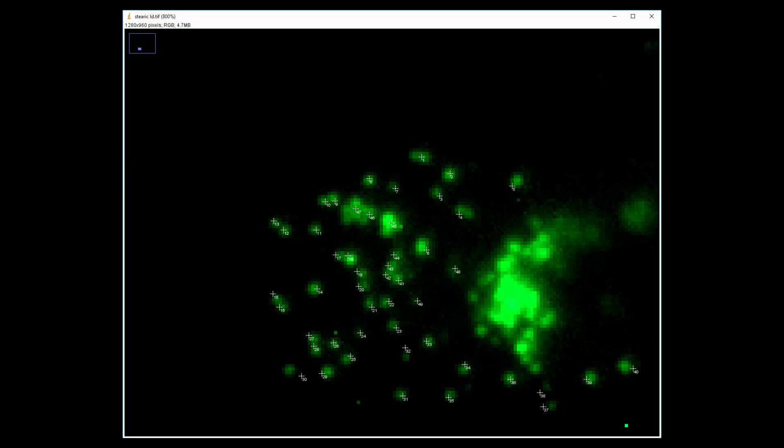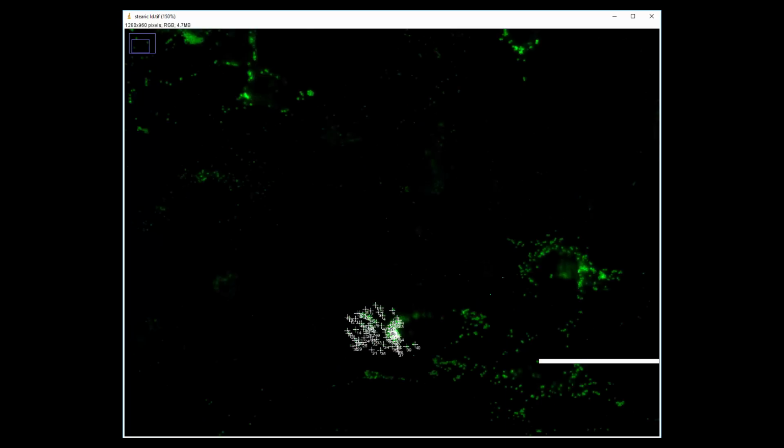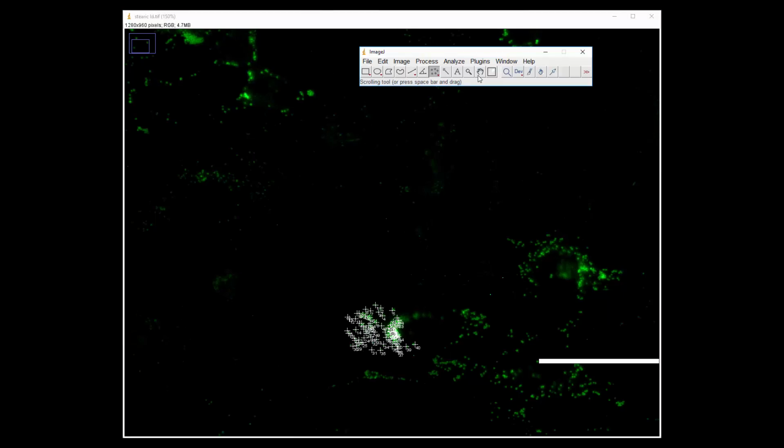But if you have to do something like this, here's what you have to do. I always go with the bright spots as my lipid droplets, and then it just gets a little bit absurd, right? And there's just no good way around it. So you would have to do something like that. That is not ideal, obviously. And so my ideal is to preferentially bias a little bit what you're doing there for those lipid droplets to have more like this. So if we're going over here, maybe we can zoom in over here just so I can show you what I mean.